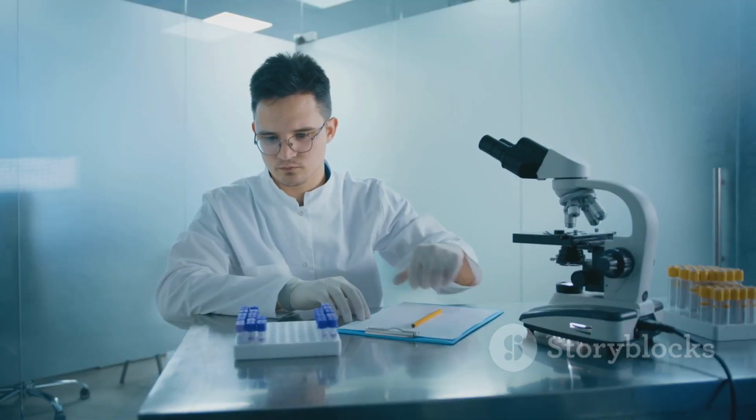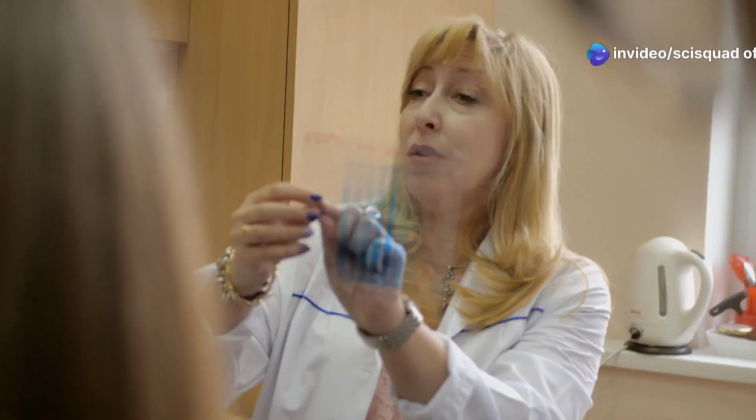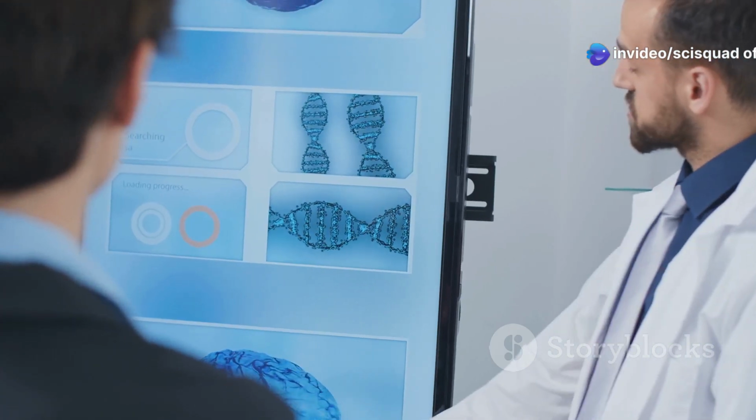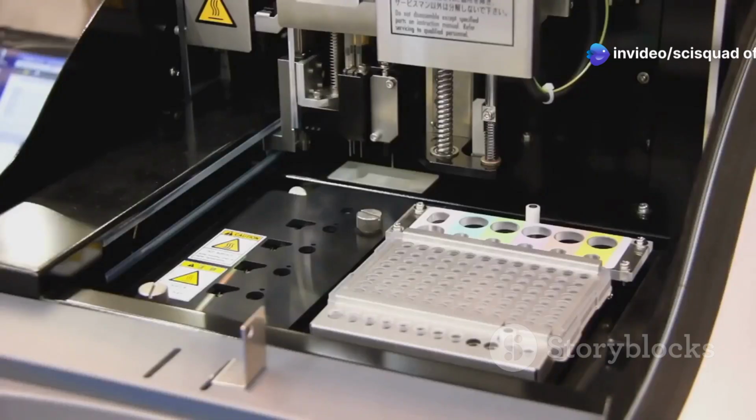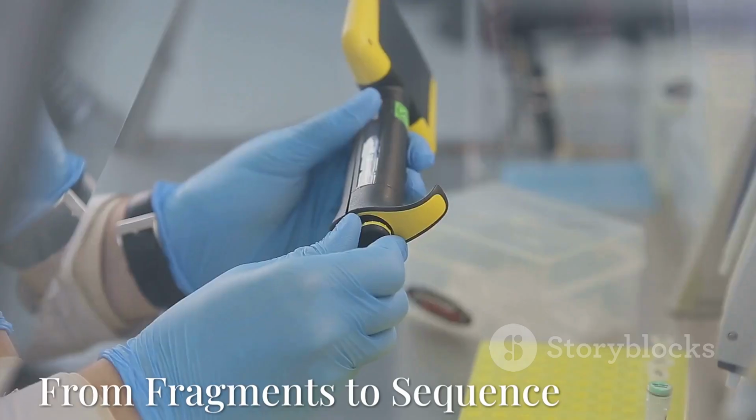Each fragment ends with a unique ddNTP. These fragments are key to deciphering the DNA sequence. They hold the secret code we're trying to crack. The next step involves separating these fragments based on their size.